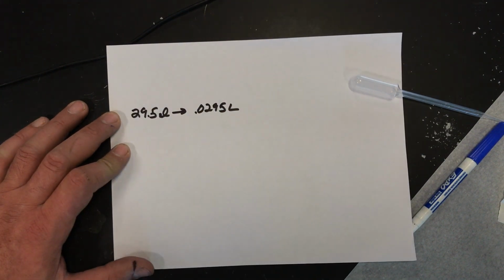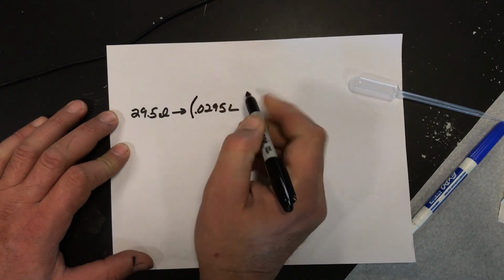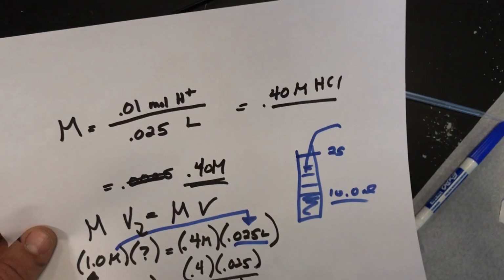That's how much acid I had to drop. How many moles was that? What was the concentration we just made? We made a solution that was 0.4.